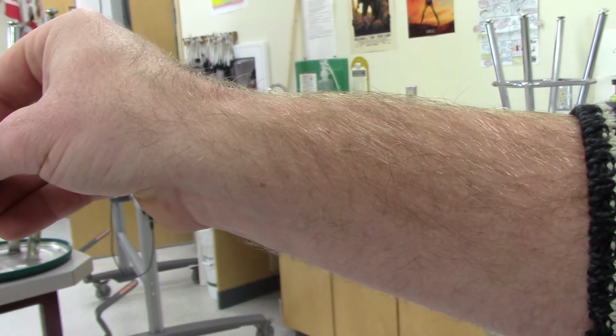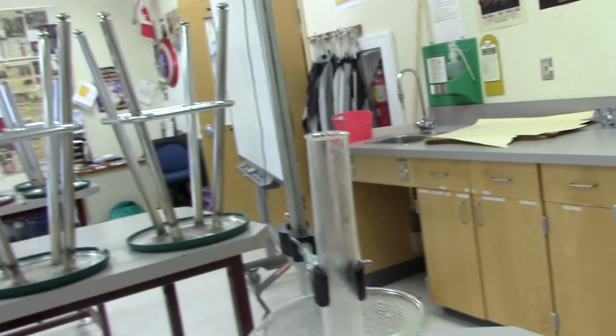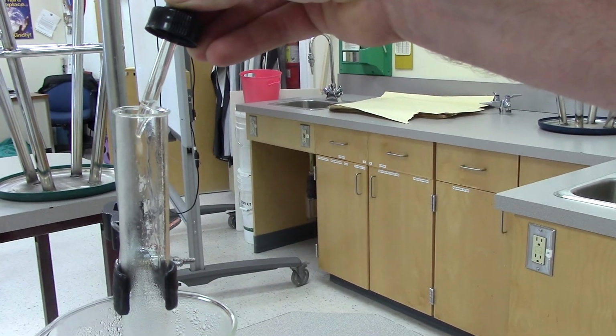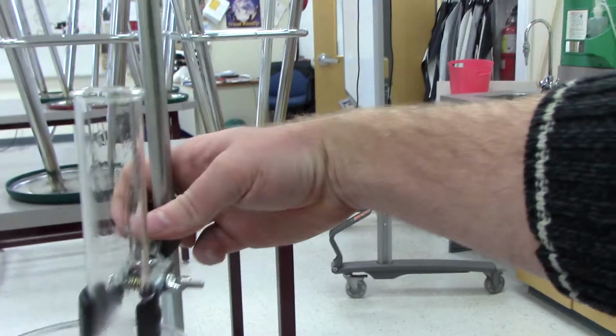Okay, so this is 20 drops. I'm just going to swirl that around a little bit.